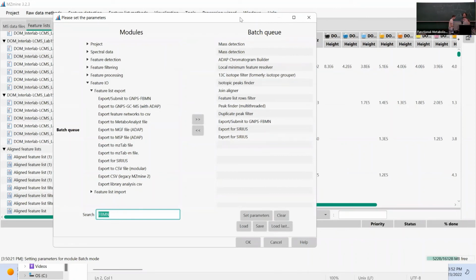But that's also going to be one result, that maybe the instrument that they use has a higher noise level, or there's some other contaminants in the data, so it might be more complex or something. But you can always sit together with your group, and maybe we can ask that every group at least gets one data set that ran with those parameters, and just get the files, because you only need 3 files that we're going to work on down the line, and they don't have to come from your laptop. So yeah.